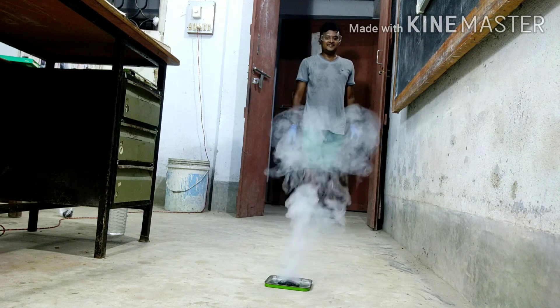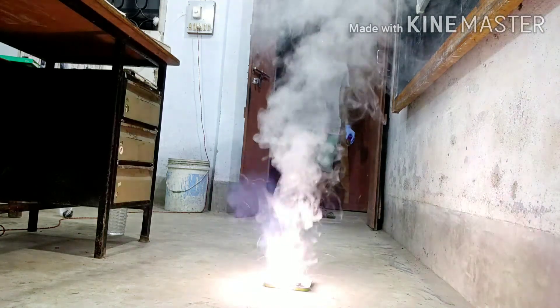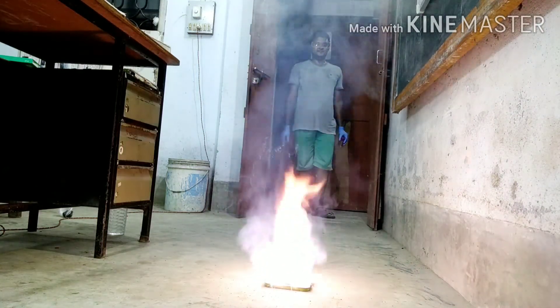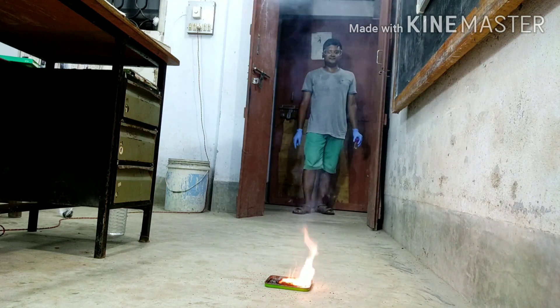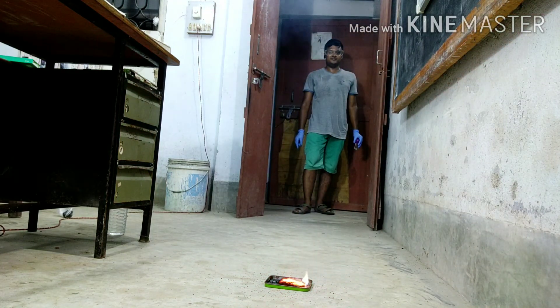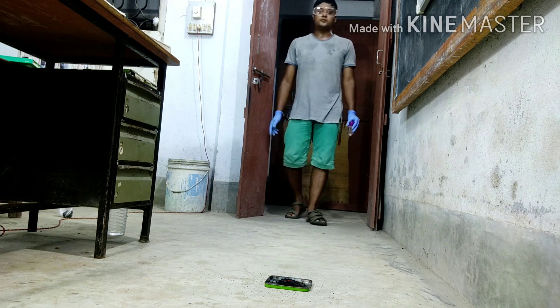See. It is very very dangerous. Don't perform at home.